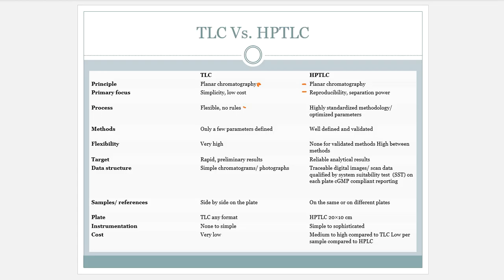The process for TLC regular plates is flexible. This one is highly standardized. It is what it is. You have to follow that. It has already been predetermined. You don't get a lot of choices. So really your power here is going to come from the mobile phase and stationary phases.